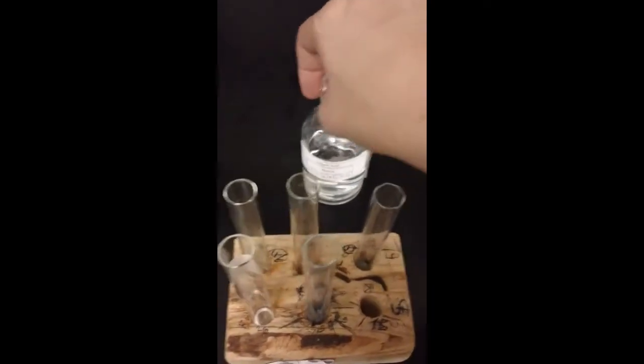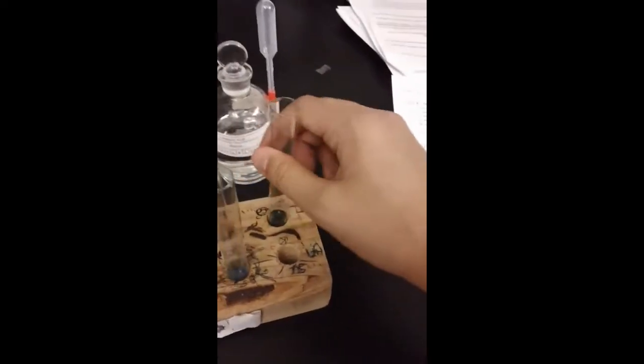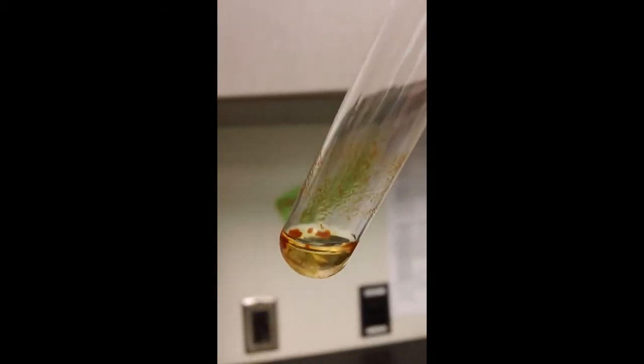So I'm adding those in. And now I need to see if anything underwent a change. So this is the CR. You're recording this in your data table under test C. And we're on step 3 of the lab. Notice how we have little clumps in this one.